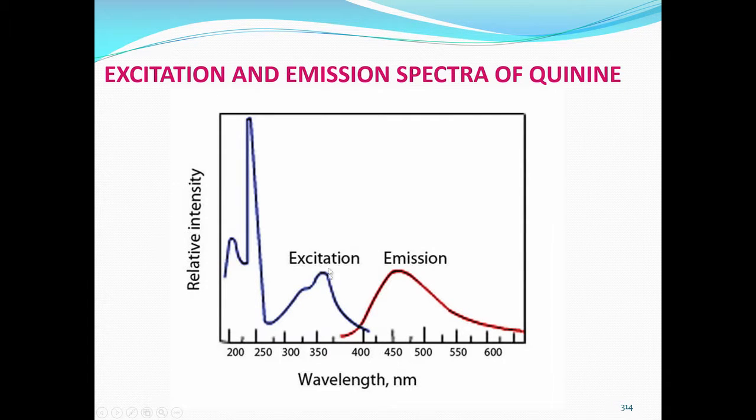So, how do these dissociation processes take place basically? That is by supplying the higher energy. So, instead of 250 in the previous slide, if I do this excitation around 350 or 375, then I can reduce the dissociation of the molecule and get a higher intensity of the emission spectrum. Okay. So, that is one of the decisions you will have to take whenever you want to do research on molecules regarding the fluorescence phenomenon.